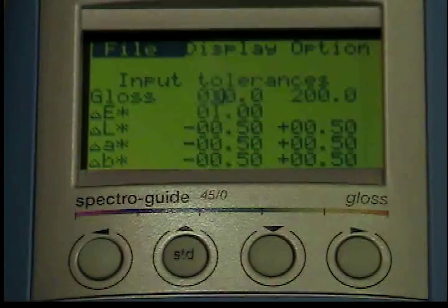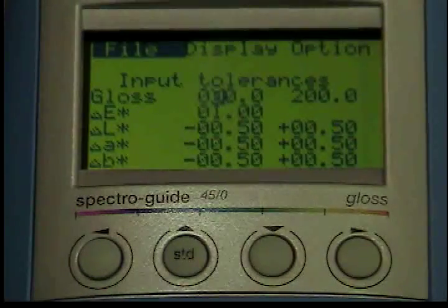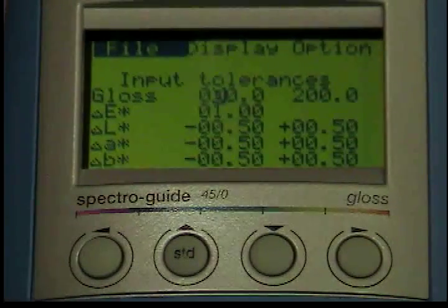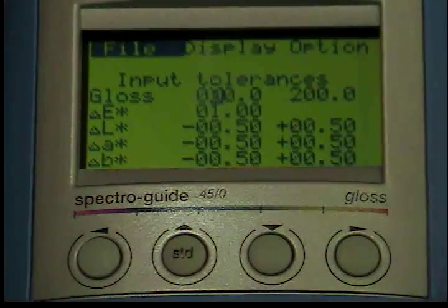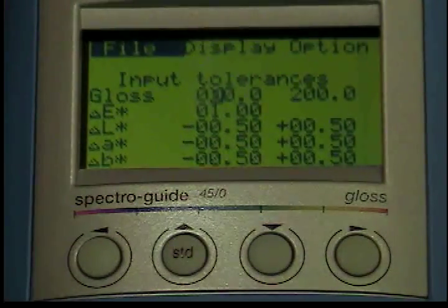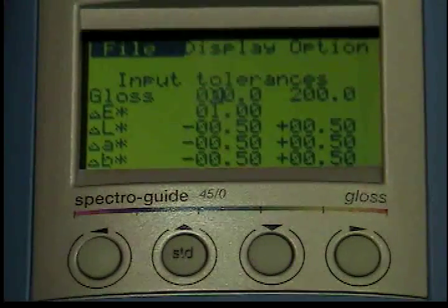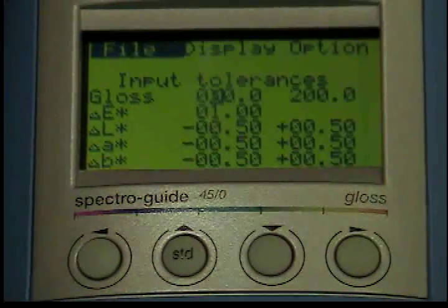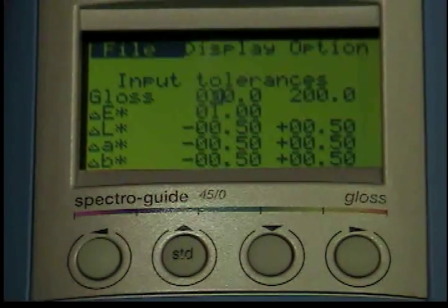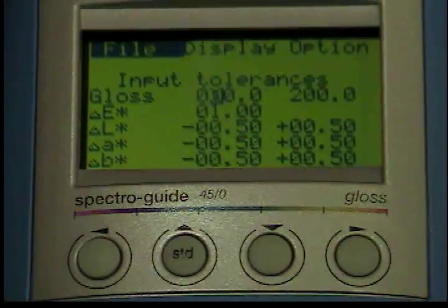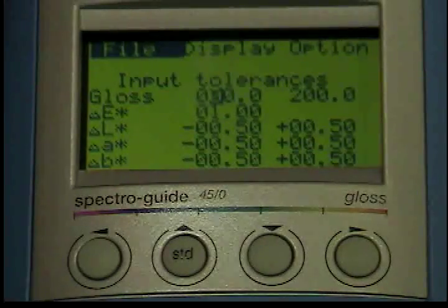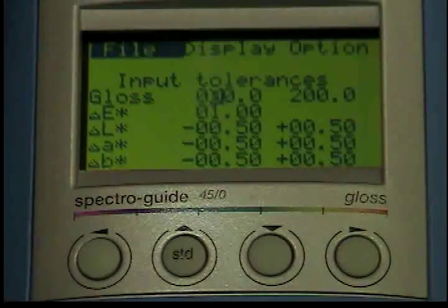You can select the appropriate letter at the position indicated by the arrow using the up and down buttons. You can use the right button to move the arrow to the next letter. After performing this input, press the operate button.